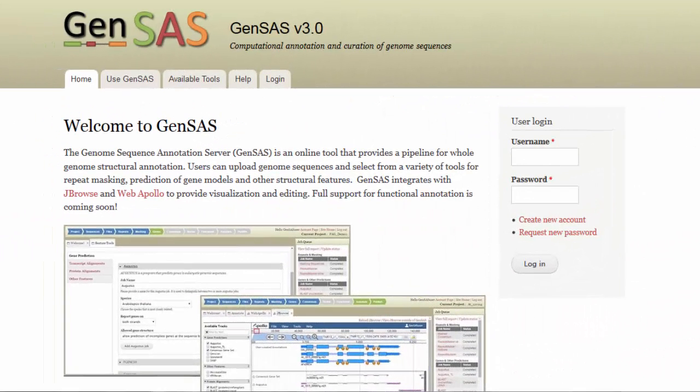Hello, and welcome to the video tutorial for the use of GenSaaS, the Genome Sequence Annotation Server. Today, I will be showing you how to create a new annotation project.